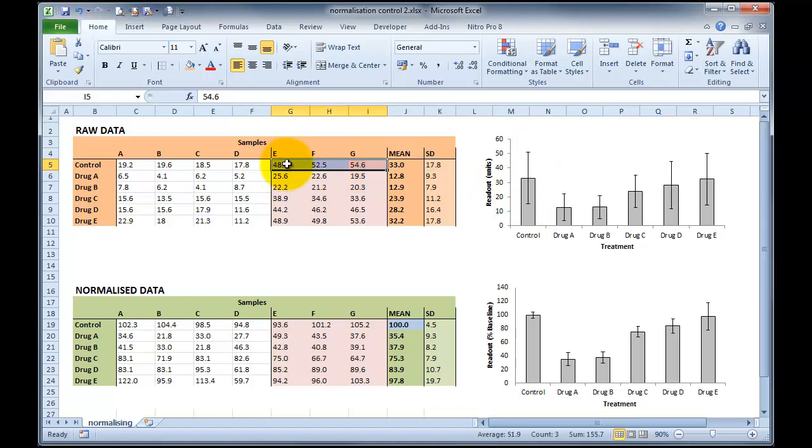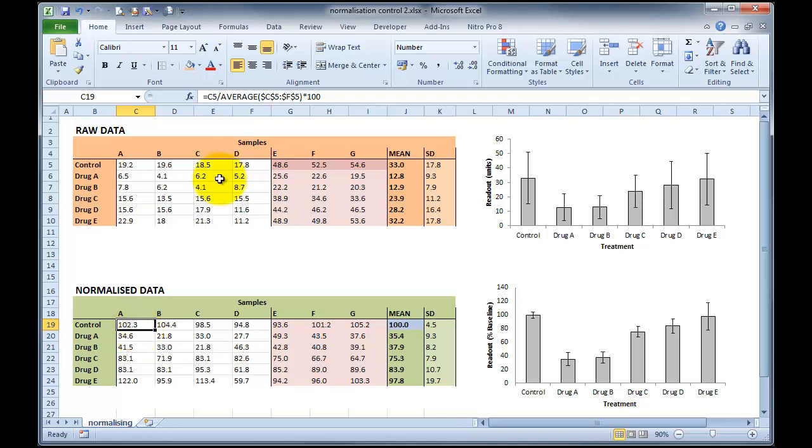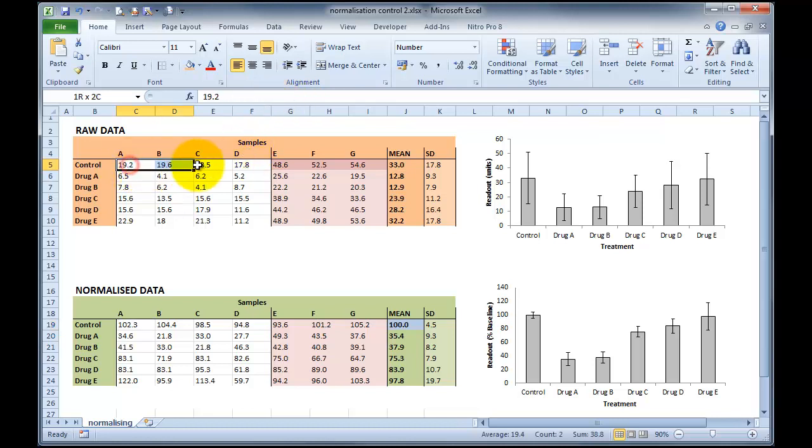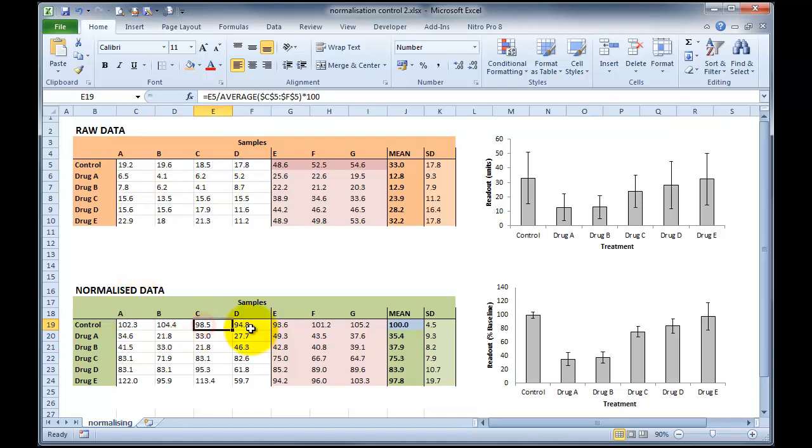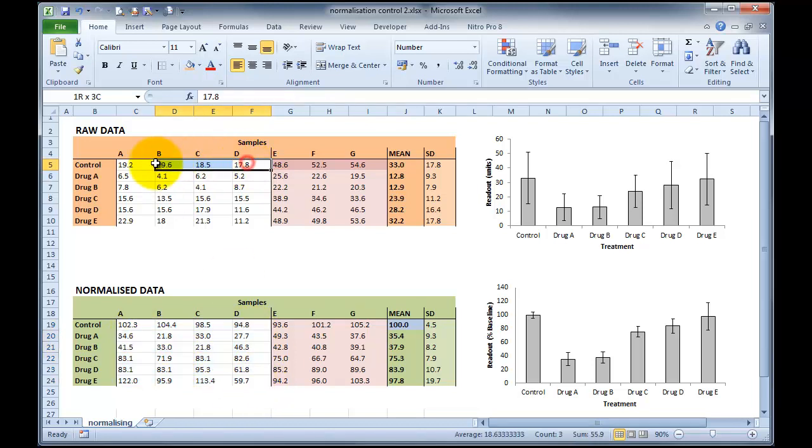So what we can do with our normalisation is we can normalise A, B, C and D to their own mean. And you can see what I've done in the formula up here is that C5, which is this cell, is this one here, sorry, this is C19. The value is C5, which is the control for A, divided by the average of $C, $5 to $F, $5. And $C, $5 to $F, $5 is this range up here from A through to sample D. And then I've applied that formula to all of the cells in this area of my data set, normalising these data to the mean of the first set of controls.